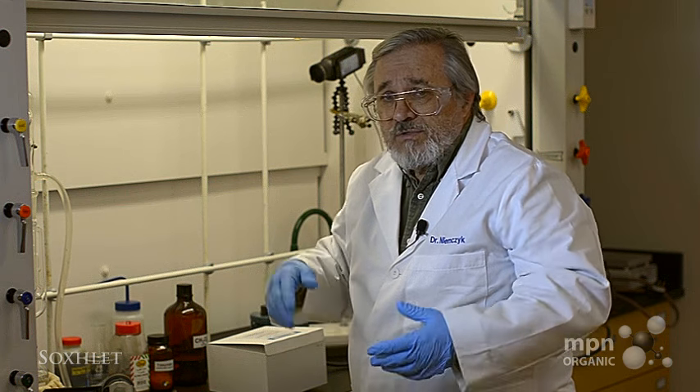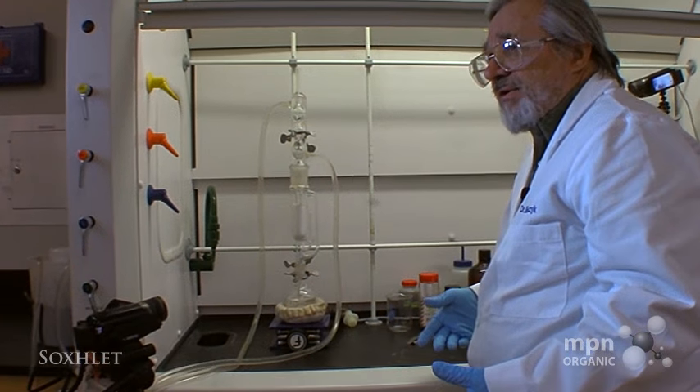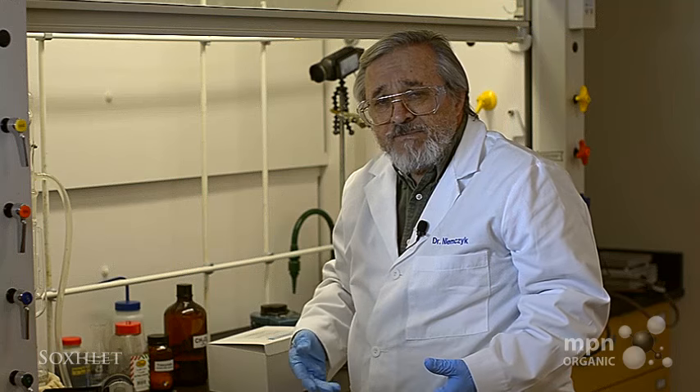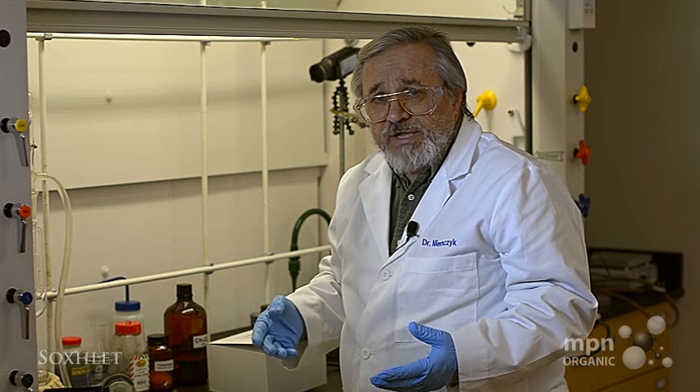These can go for days if you want, and that's what makes this effective. It can be run without the supervision that's necessary for a lot of other operations in the organic lab.